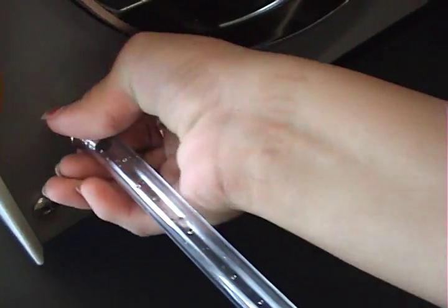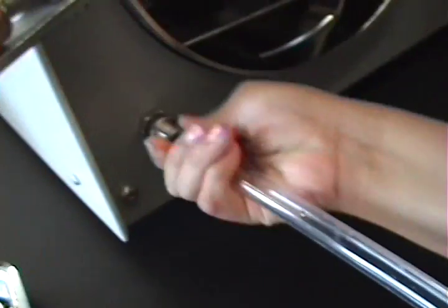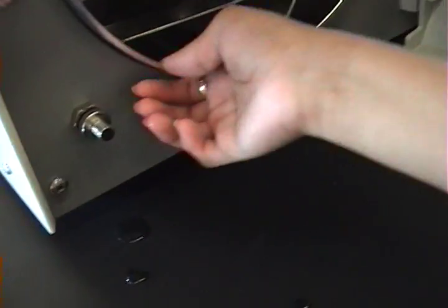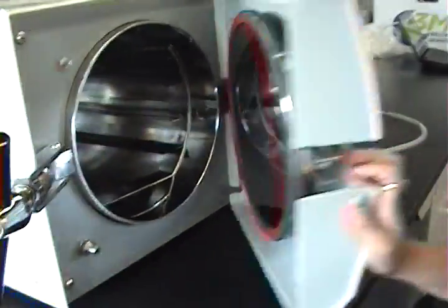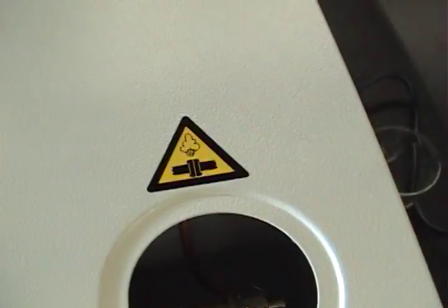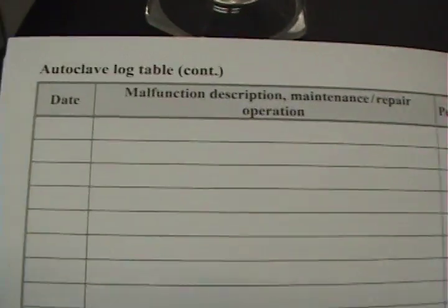There will be less water than when you started. Make sure all the water has come out. Loosen the nut a little longer to check if any water remains, then pull the tube out — a little water may drip. Simply take a paper towel and clean it off, then close the nut so no other water can drip. Close the autoclave by tightly moving the nut. Make sure the reservoir is empty, and record all your readings in the manual.